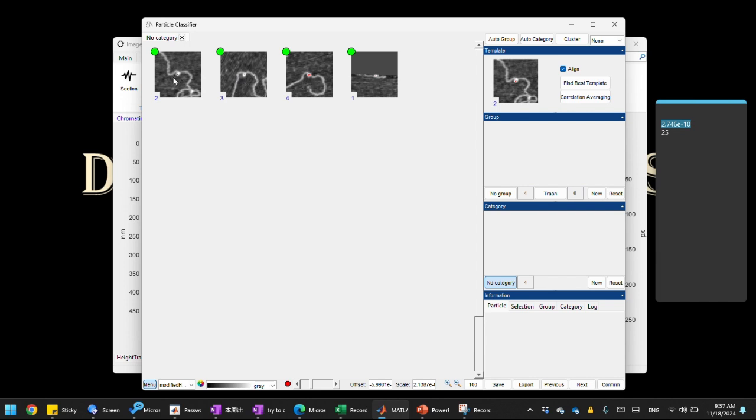Not the box that we created. But that's not an issue as long as the actual data used for the correlation analysis is the boxes, right? So we're not using these masks as shown here for our correlation analysis. We are actually using the mask area within that box. It's just that the box is not shown.